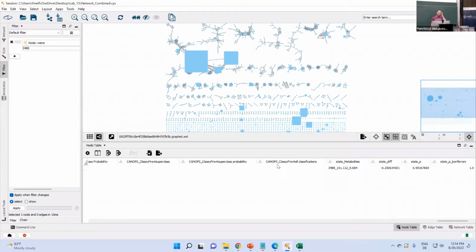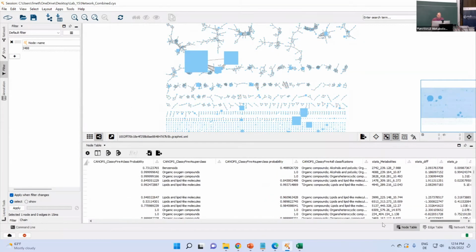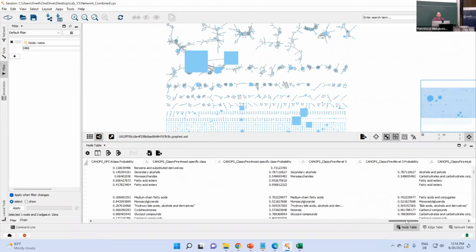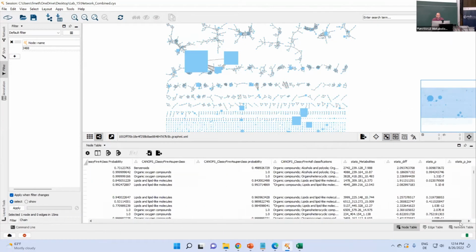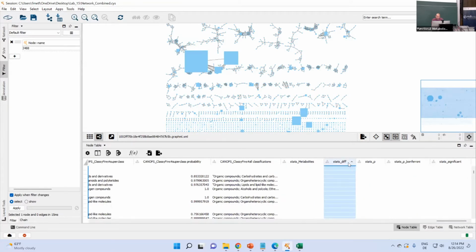And now, with the style, I could highlight features based on whether they were significant. I can also sort and go down from the strongest changes, and explore my data that way in a little bit more systematic fashion. Okay, if you want, you can do that while I'm doing it. And for this lab, let's actually sort this here.